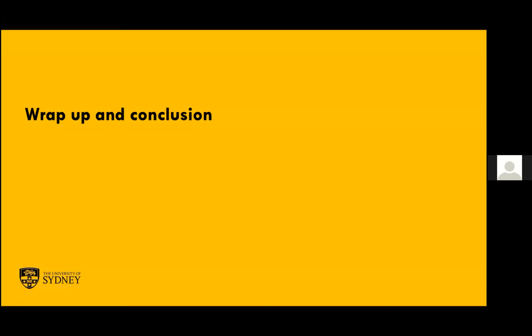Can I just ask you a question instead of typing? Of course. So basically I have a question. We are using 10x feature barcoding, the BioLegend feature barcoding. In our panel, it has 4 I think isotypes. Can we use those isotypes for the normalization of the ADT data?